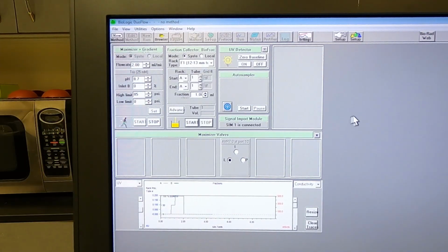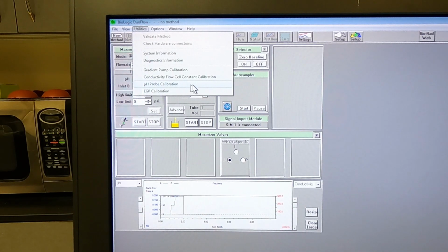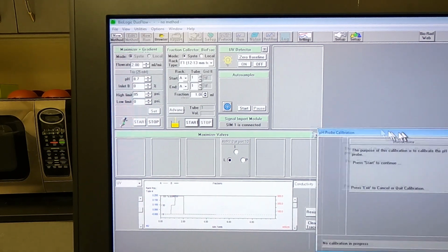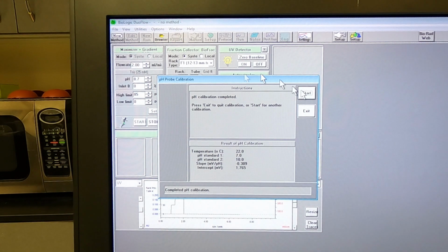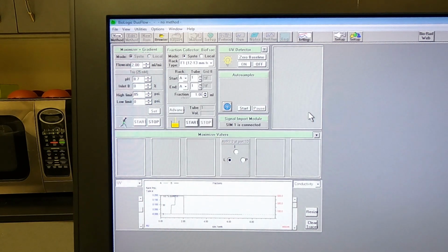So now I'm going to show you how we calibrate the pH meter. Go to our utilities menu, and you see here we have pH probe calibration. Click that. It's going to open our calibration window. And it just gives you the instructions here. The purpose of this calibration is to calibrate the pH probe. Press start to continue. Calibration has been completed. And now we can exit or repeat the calibration by going to start.